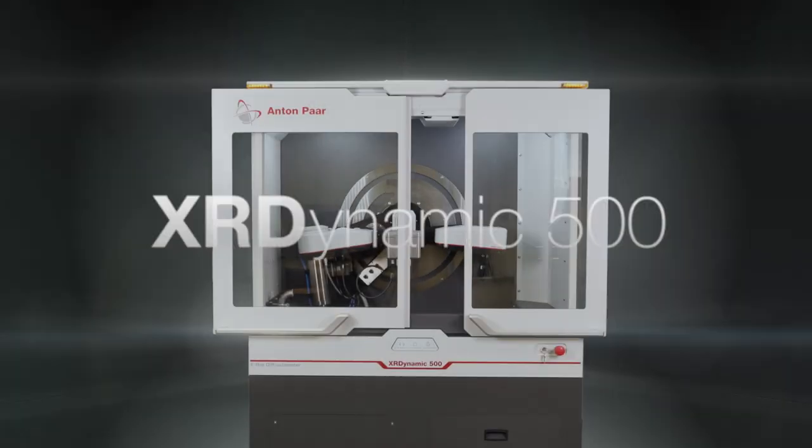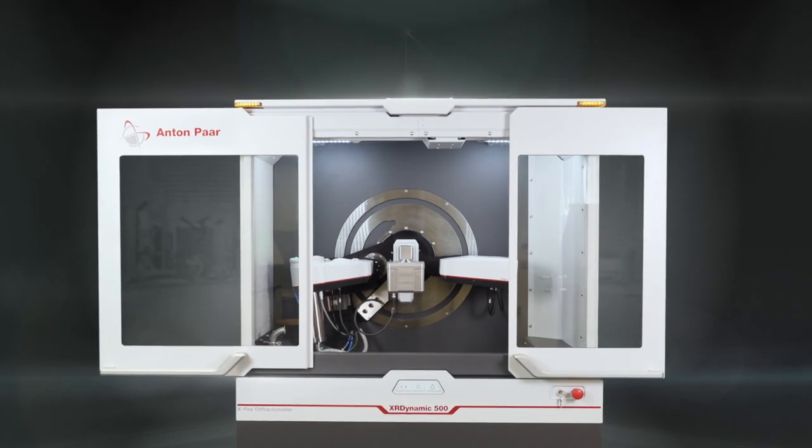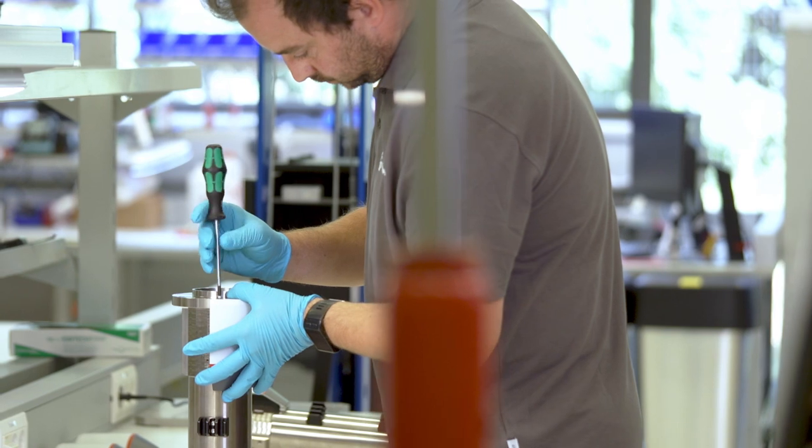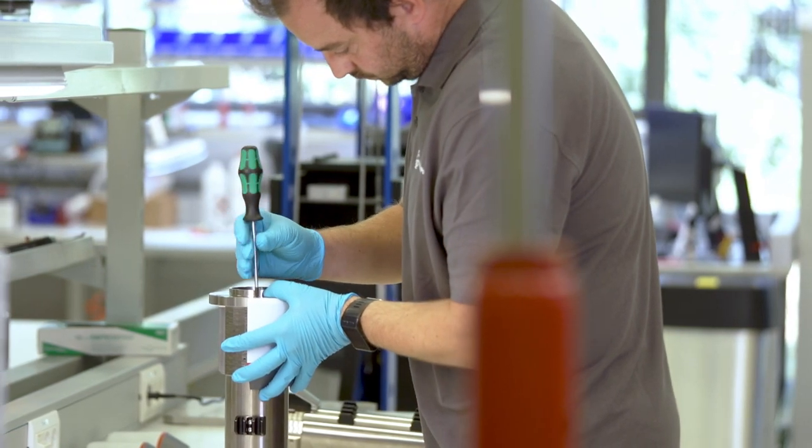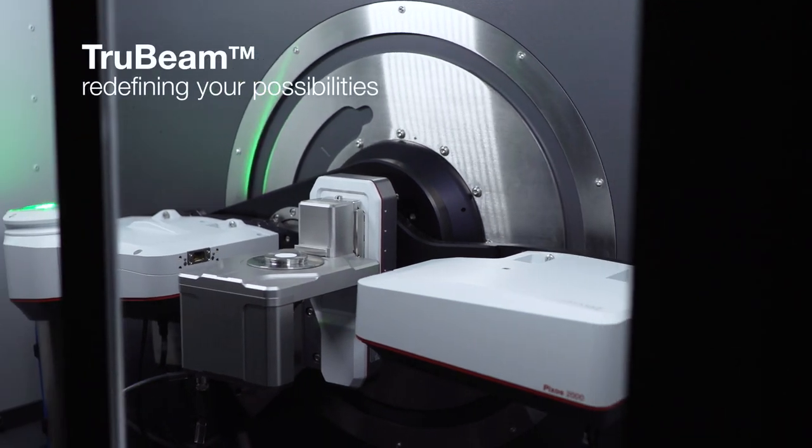Introducing our new diffractometer, XR Dynamic 500. We've taken the best from our market-leading x-ray technology, combined it with a radically new engineering and design approach to bring you a tool that recharts the map of the field with a patented true beam concept, redefining your possibilities in the lab.